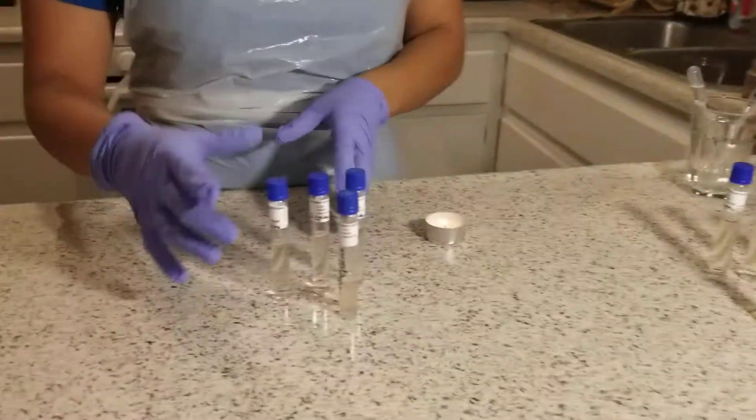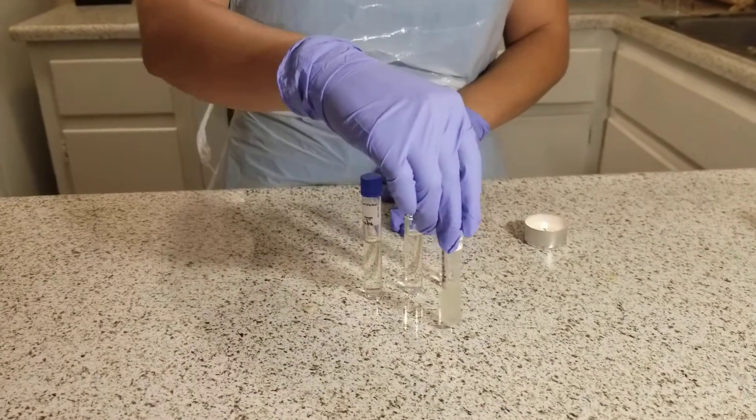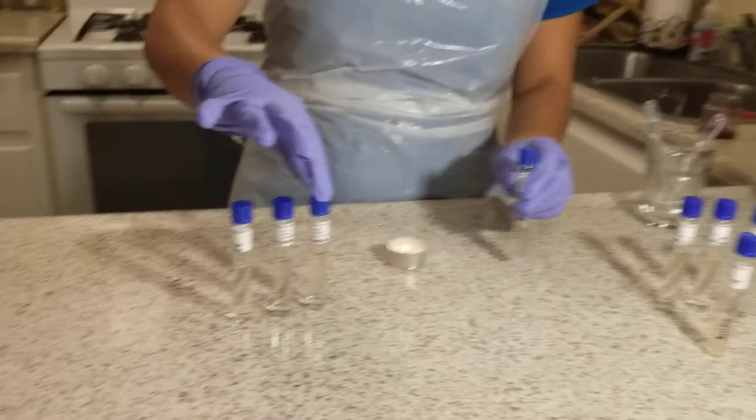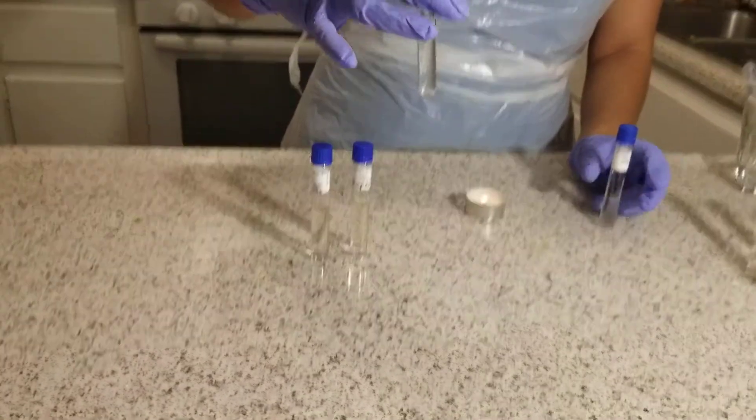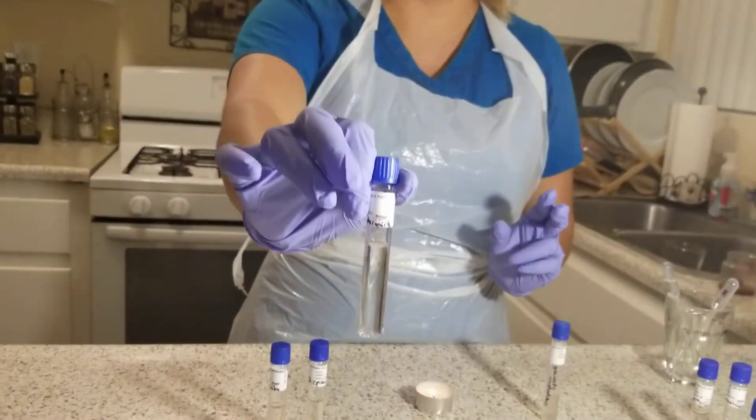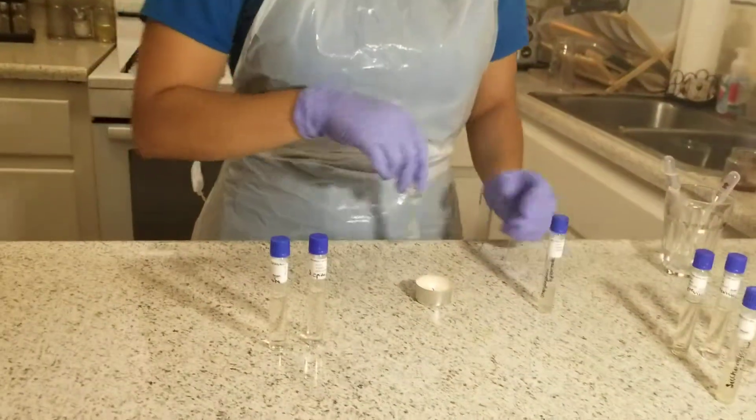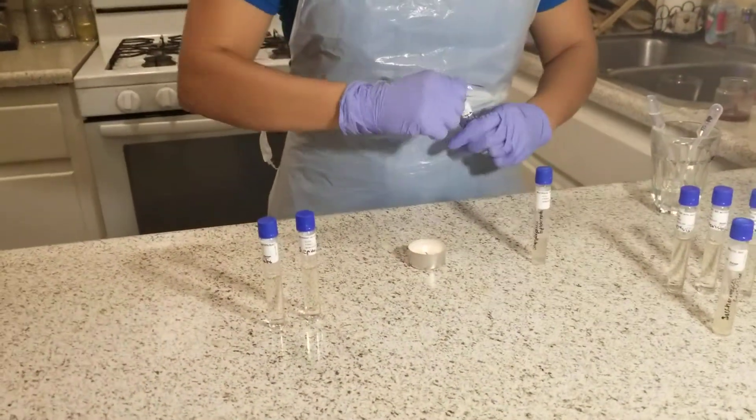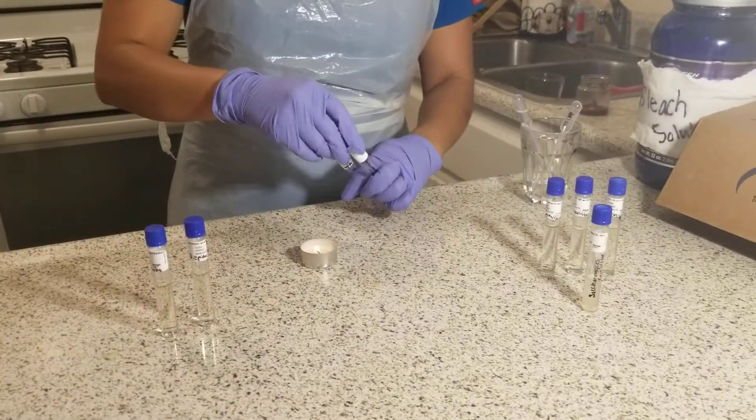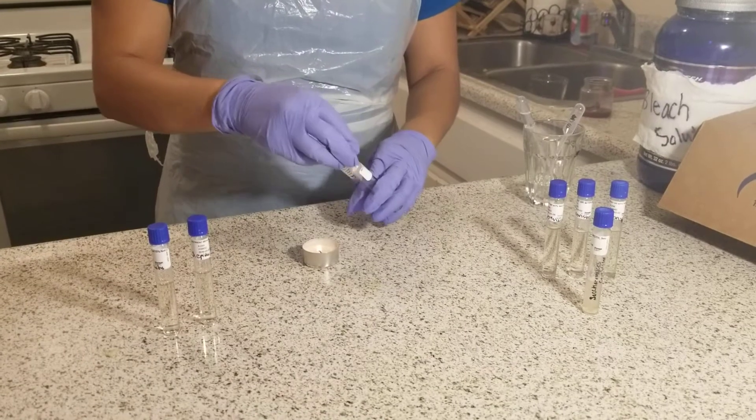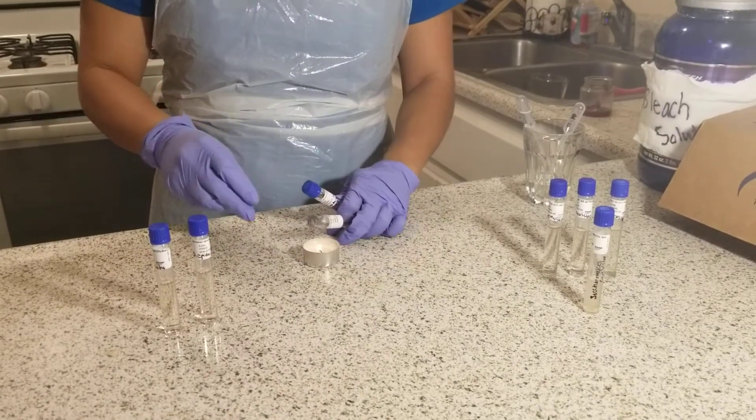Now I'm going to demonstrate how I did that with my Staphylococcus epidermidis. First, I'm going to grab my 1% sodium chloride tube. Then I will take my culture vial of the bacteria and sterilize the lid.